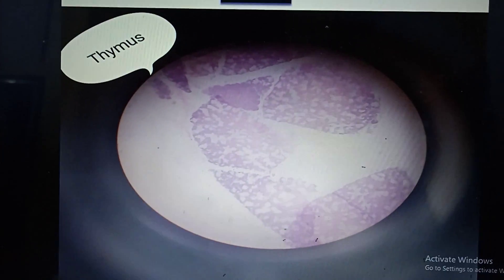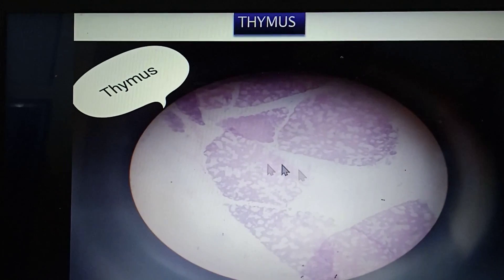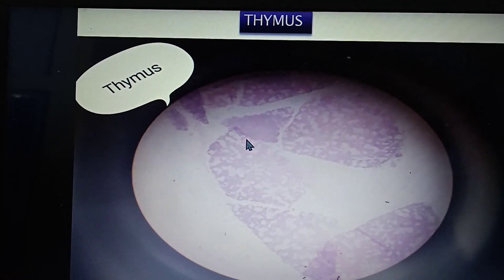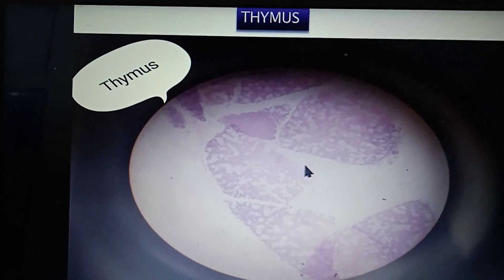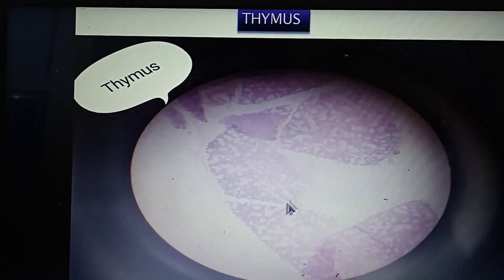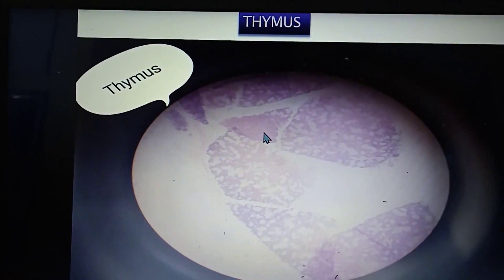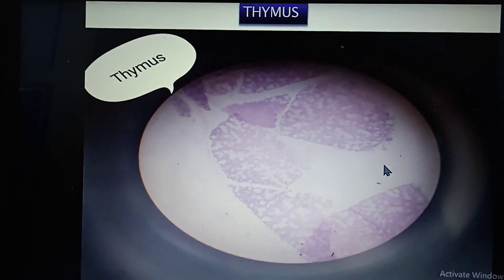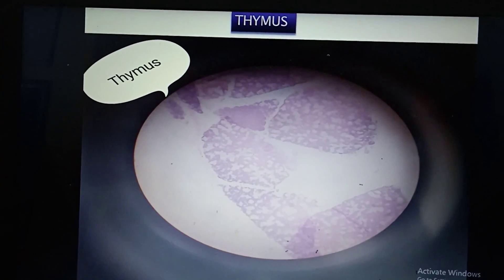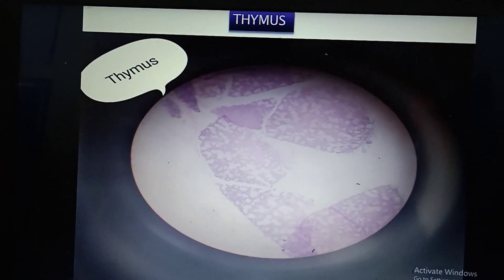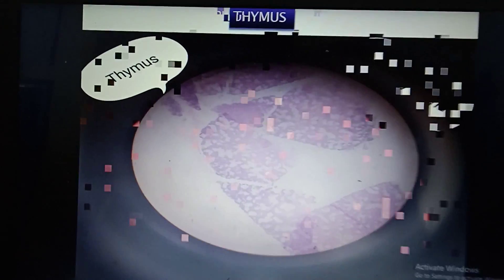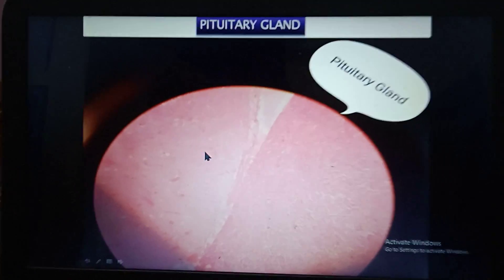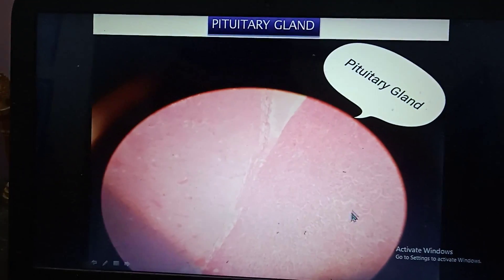This is the thymus, evidenced by incomplete septation — the septa do not go all around — so incomplete septation is very much characteristic of thymus. It also looks like a leaf pattern and is very similar to parotid, but the incomplete septation is the peculiar feature.